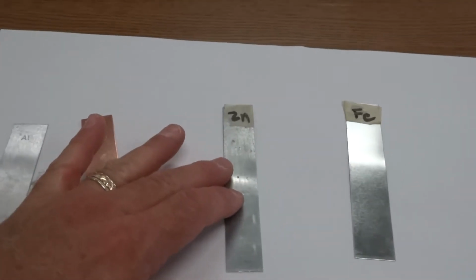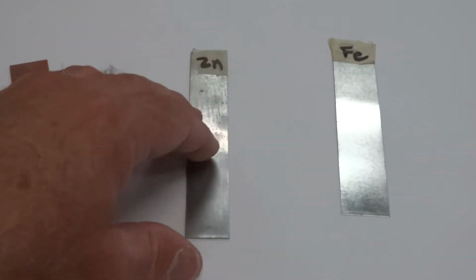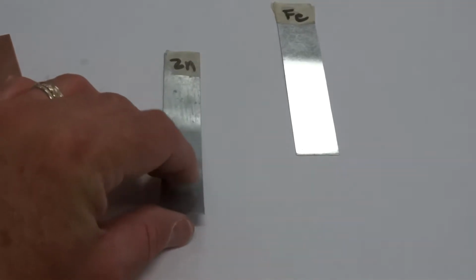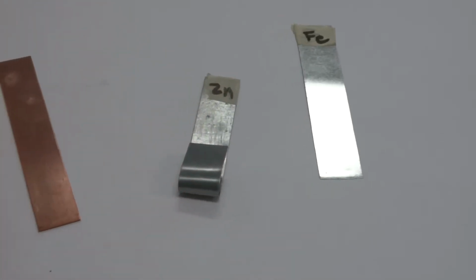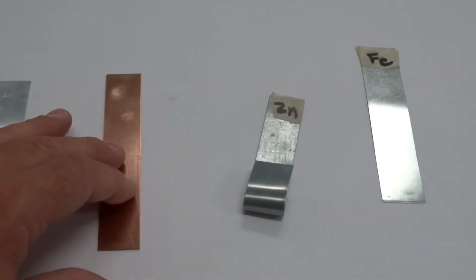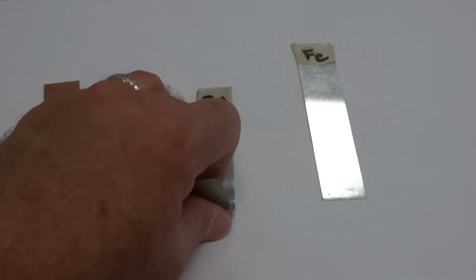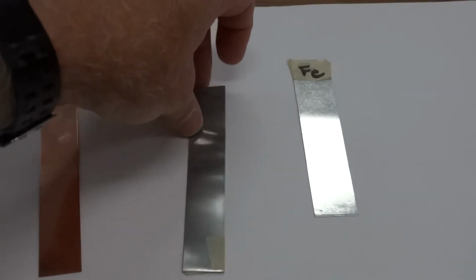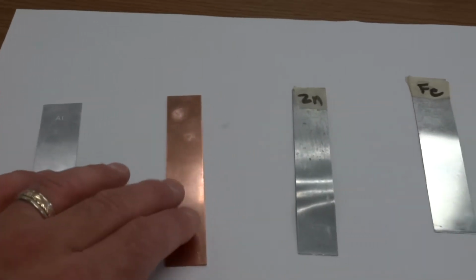The next item here is zinc. The chemical symbol, excuse me, for zinc is Zn. So I'm going to bend the zinc a little bit. The zinc is much more rigid than the aluminum was, and a lot less rigid than the copper. The zinc bends much easier, and I can bend the zinc back. So zinc has malleability so far, and so does aluminum, but copper does not.